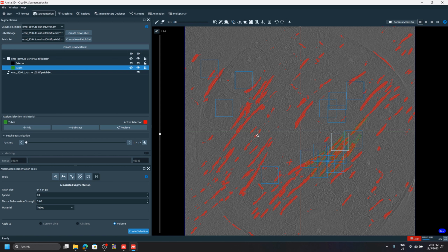So you have to spend more time on it. Sometimes maybe you have to tweak the parameters. So there's a bit of an art to it and a bit of trial and error, right? And for most of you who have deep learning experience, it's just that. It's just a lot of trial and error, okay? So I don't want you to be disappointed, so I'll show the better results.